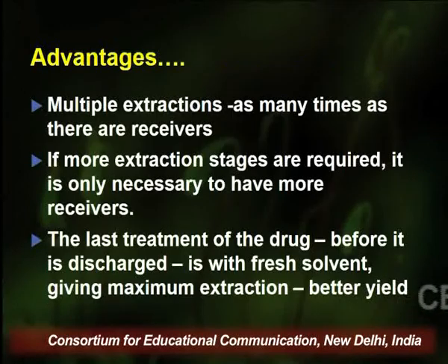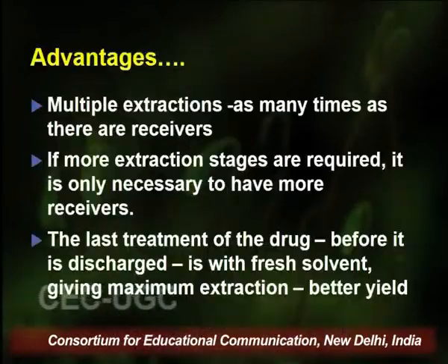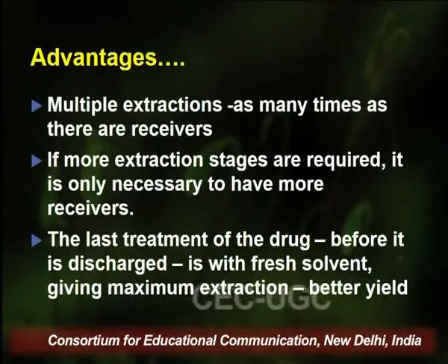The major advantage of the multiple extraction method is that we can increase the number of extractions just by adding receiver containers. In the previous picture, we have seen 3 solvent containers, container 1, 2, 3. If you want to increase further, we just have to add another solvent container, container number 4. So you can increase the number of extractions by just adding additional solvent containers in the whole setup. If more extraction stages are required, it is only necessary to have more receivers. This is what we were talking about.